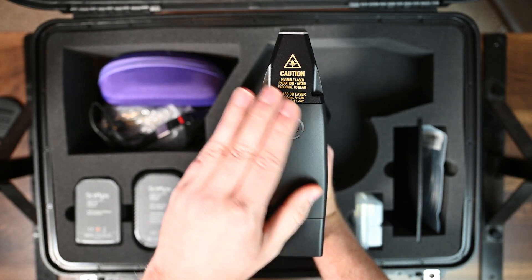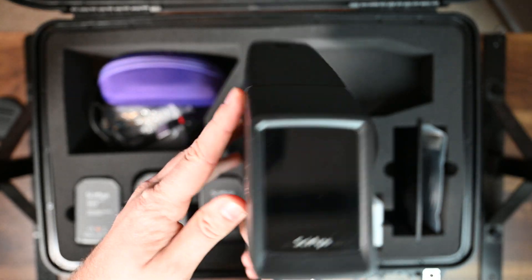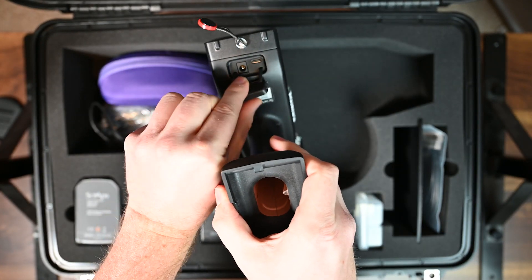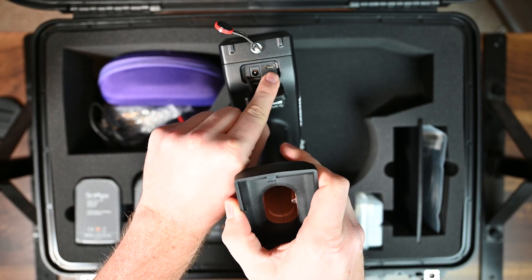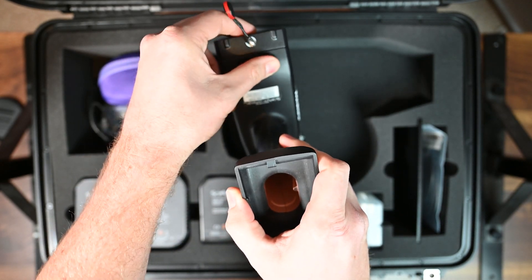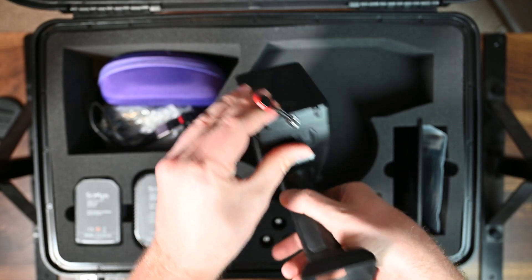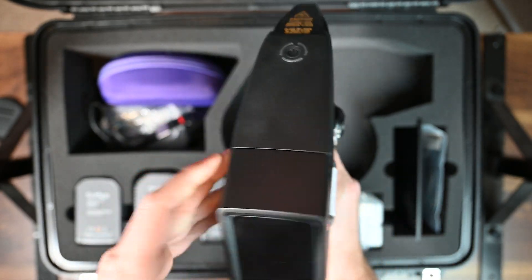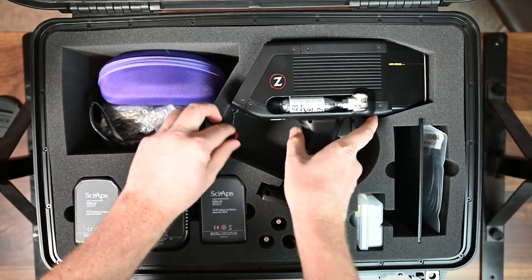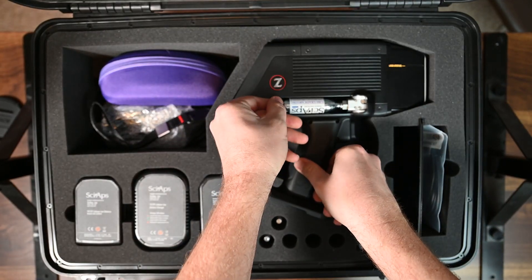The top has a relatively sleek profile with a power button up top. On the back underneath there's a rubber boot — that's where you can plug the unit in directly for power, and there's a USB port there as well. Those rubber boots can be stubborn sometimes but they're roughly all the same, and this one is really no different.